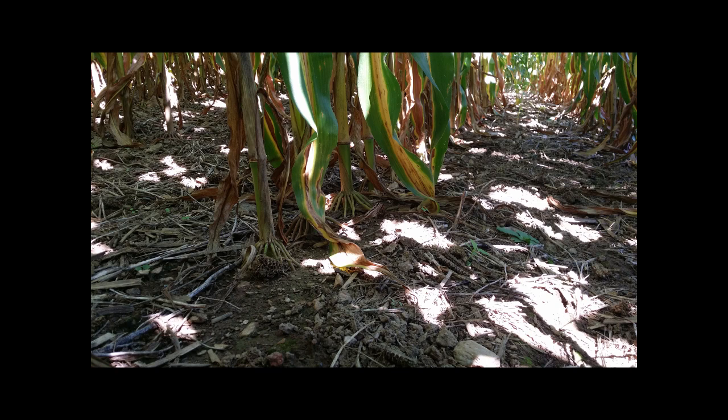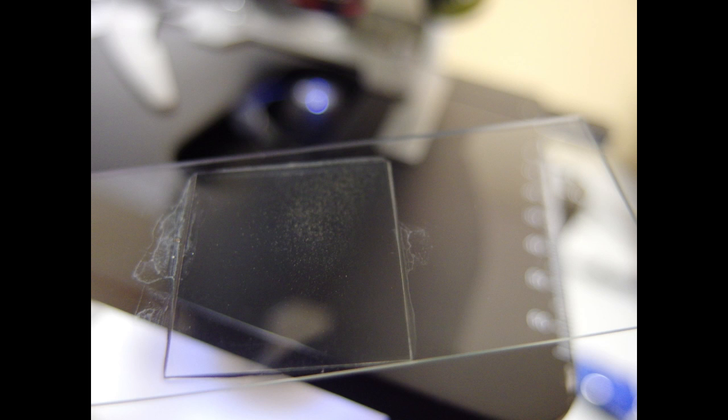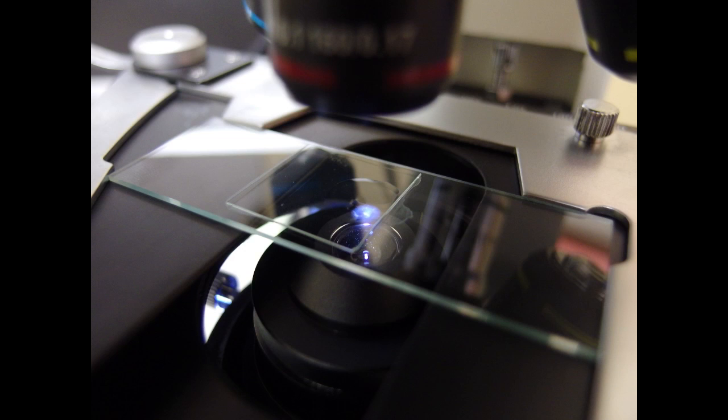A small amount of soil taken from near the root zone of these corn stalks is combined with distilled water in a specific ratio that, once settled, allows the viewer to prepare a clear microscope slide.